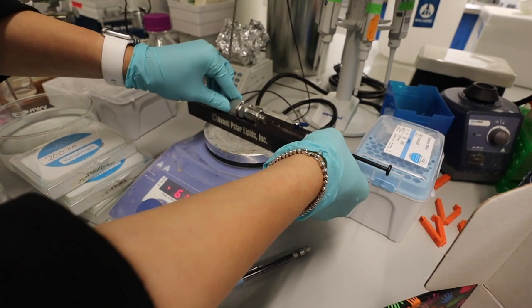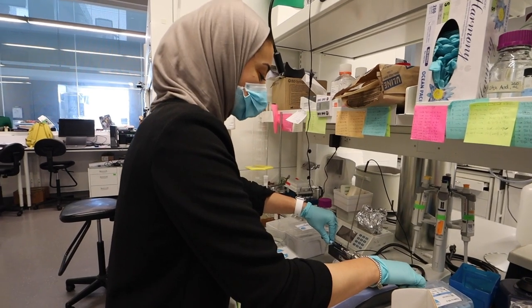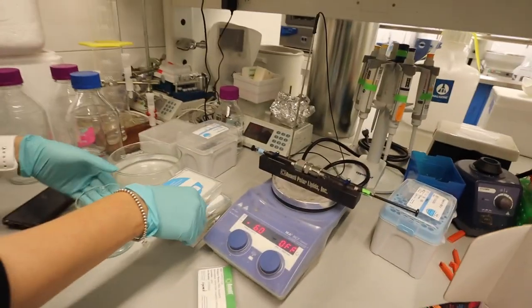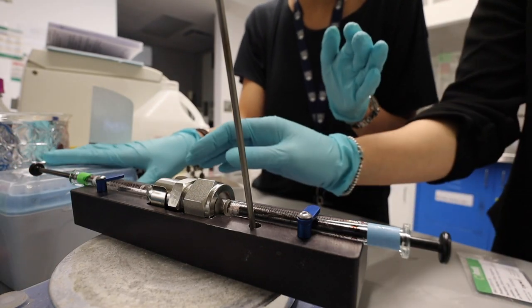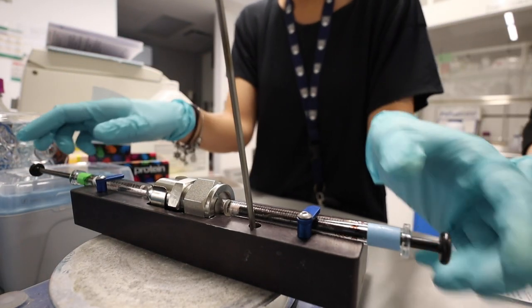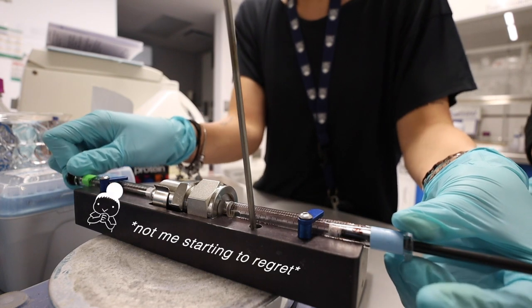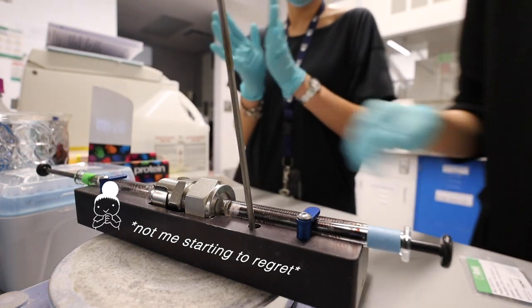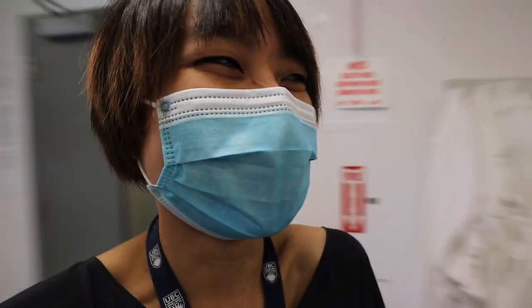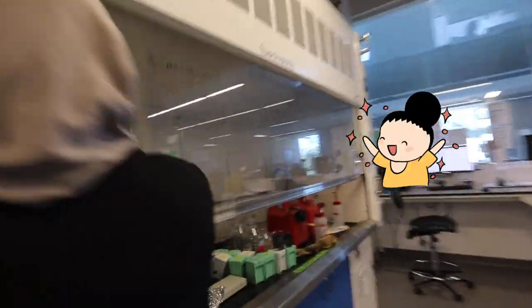First one, I'll try to make sure that it's not leaking. Is it leaking? No. Can I try? Yeah. But water is fine, right? Yeah. It's easy, it's just water. Whoa, it's hot. Where do you put your hands? Here. Oh, so you don't touch this block? No. Push. Oh dear. This is just water? So it's going even harder. Hell yeah. Okay, that was just water. That was so hard. Now we're gonna do the lipids. I told you we're gonna change your mind. I'm gonna maintain a positive attitude cause you're here.